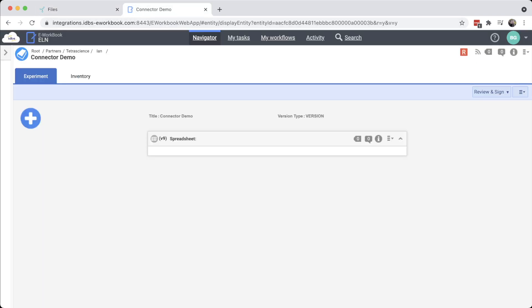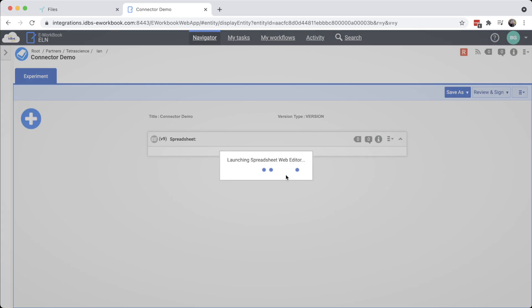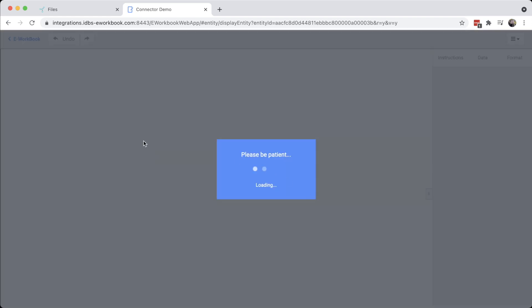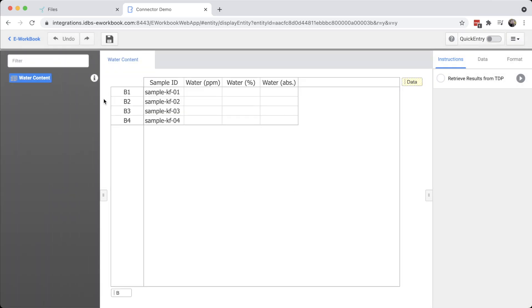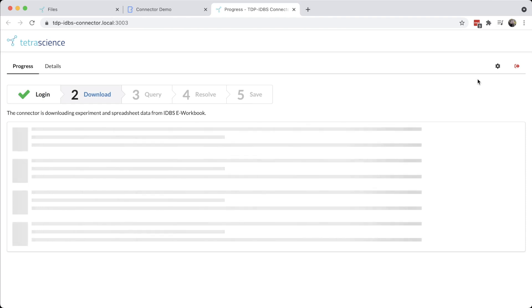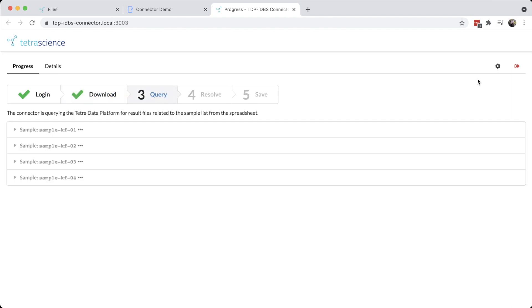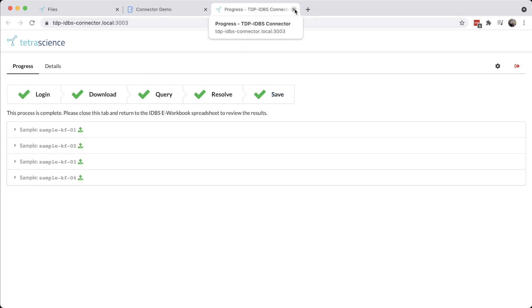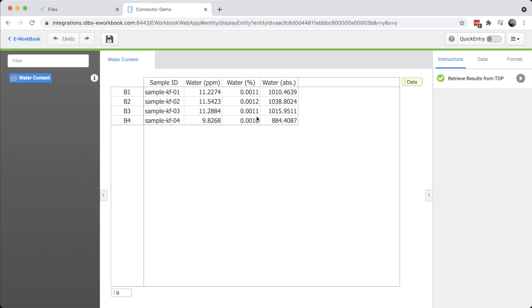Now I'm switching over to the IDBS eWorkbook. I've already created an experiment and added a spreadsheet, which I will open up here. In the spreadsheet, I have a table with a list of samples that I'm measuring water content for. Over here on the right, I have a button to retrieve the results from the Tetra data platform, which I'm clicking right now. A new tab opens up in the browser to show the process and the progress of bringing data from the Tetra data platform into the eWorkbook spreadsheet. When it's finished, I can just close the tab and my data is already showing up in the spreadsheet.